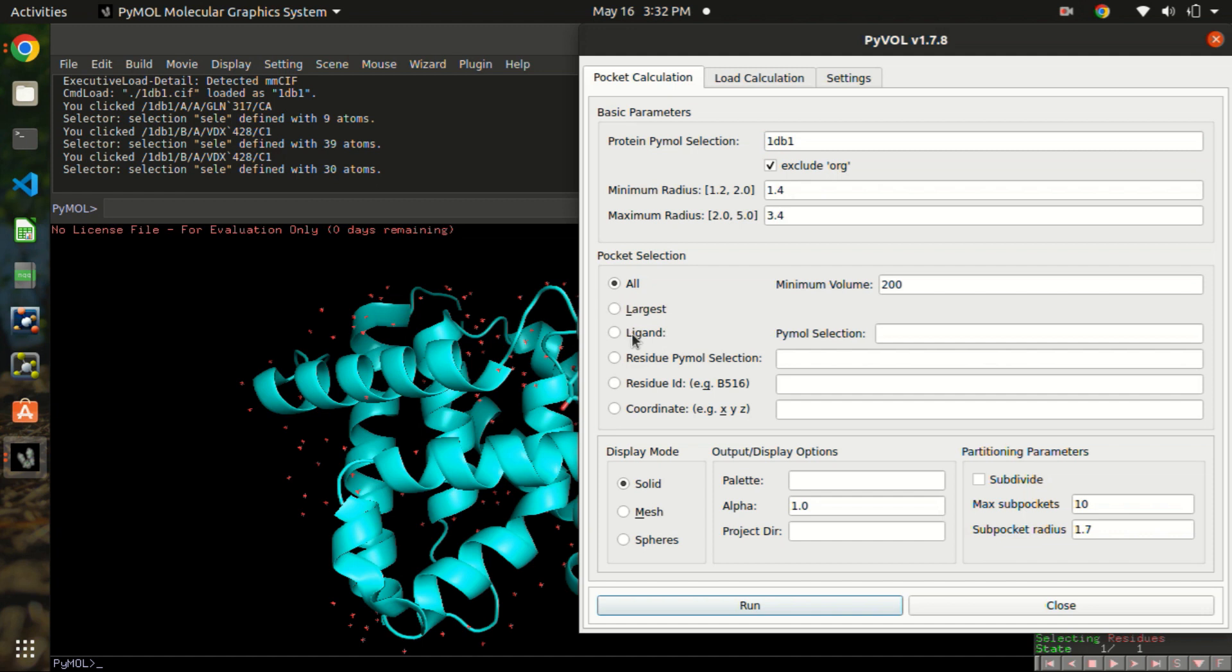Now the pocket selection - we are not doing the whole protein, we are just doing for the ligand. Select the ligand and name the extracted object. Here it is obj01. You can tune all these parameters according to your needs.